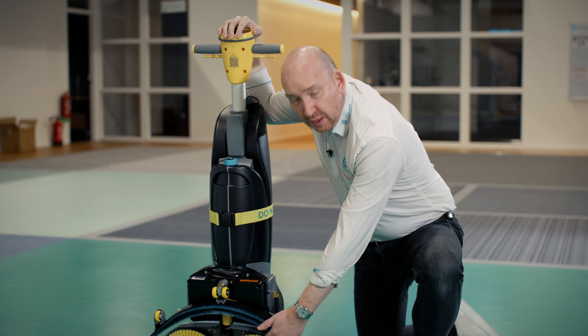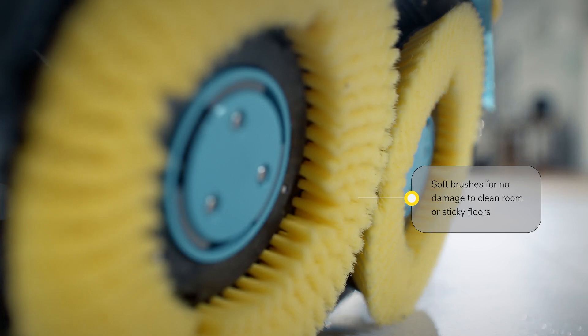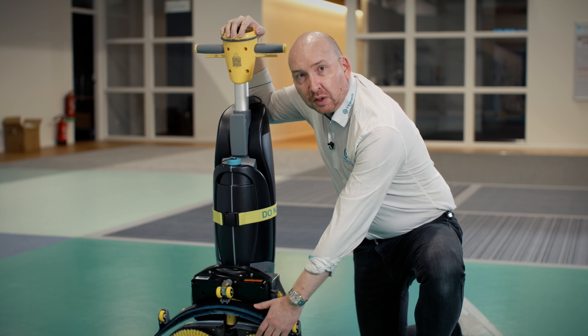Finally, we have our yellow brushes. These are specially designed to be used on clean room floors and sticky floors in between the clean rooms. They're the perfect solution to not damage your floor and to keep it the cleanest.